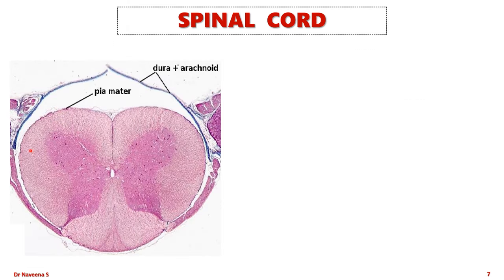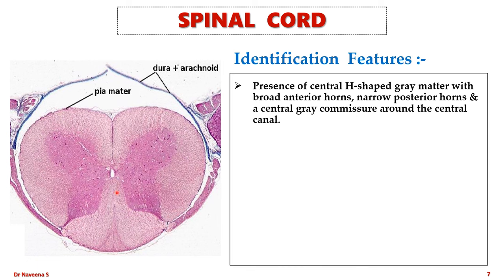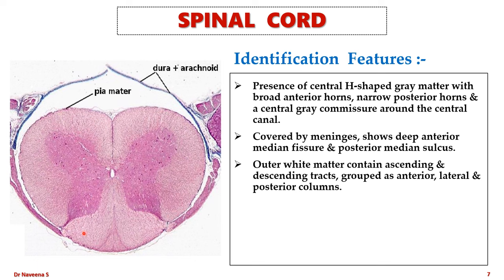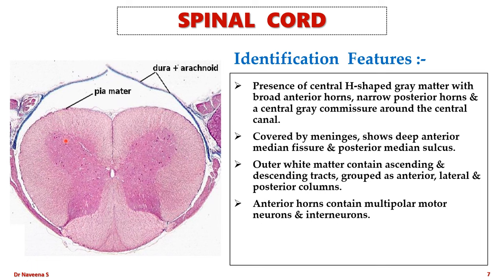Coming to the spinal cord. Here is the cross-section of spinal cord, which can be observed completely under a dissection microscope without any magnification. It can be identified by the presence of H-shaped grey matter with broad anterior horns and narrow posterior horns, connected through a central grey commissure around the central canal, which is lined by ependyma. The spinal cord is surrounded by meningeal layers and shows a deep anterior median fissure and a narrow posterior median sulcus. The spinal cord contains outer white matter and inner grey matter, with axons of nerve fibers running in anterior, lateral, and posterior columns as ascending and descending tracts.